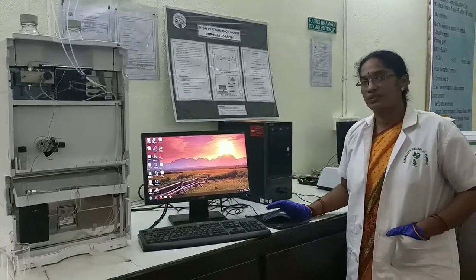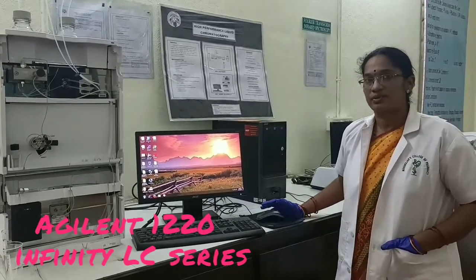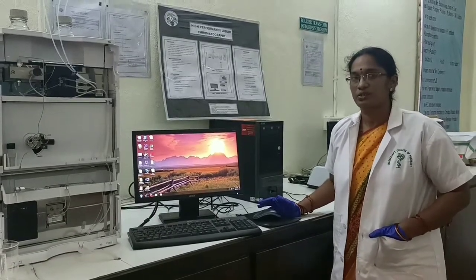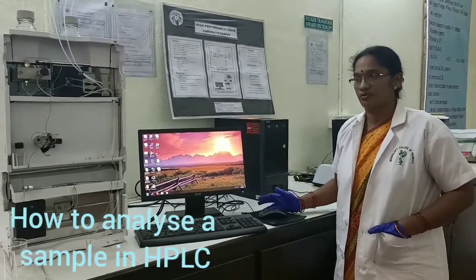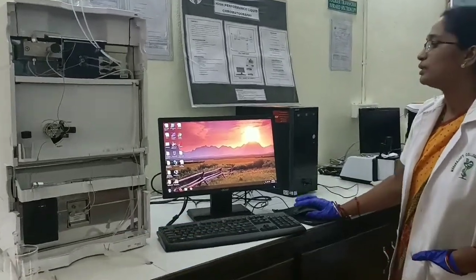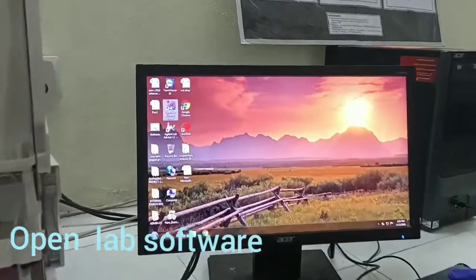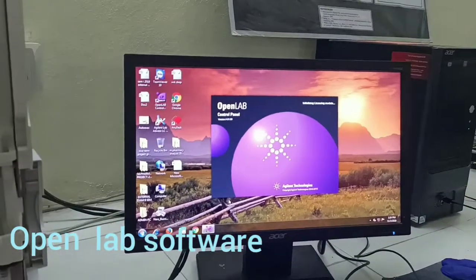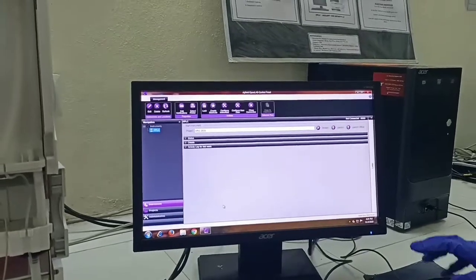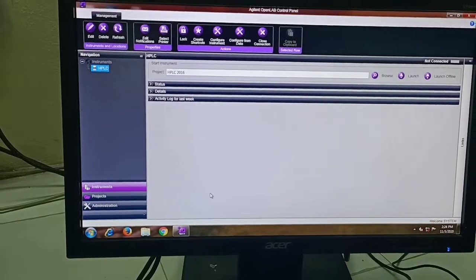As I told you in my previous video, our HPLC system is the Agilent 1220 Infinity Series HPLC system. So dear students, today I will be showing you how to analyze a sample by using this software and our HPLC system. For this, first of all, I need to open the software, that is the OpenLab software. So this is the primary outlook of the software, dear students, with different modules.